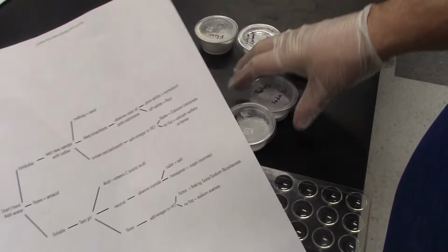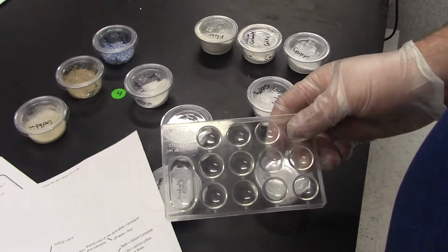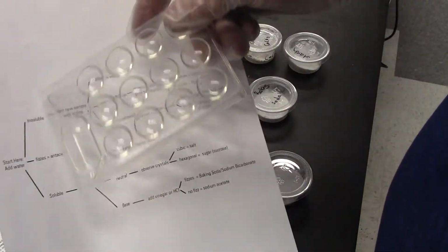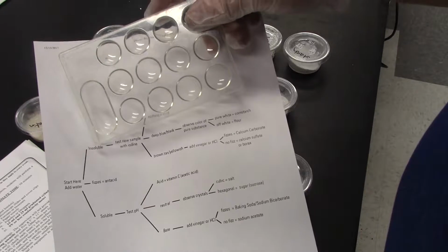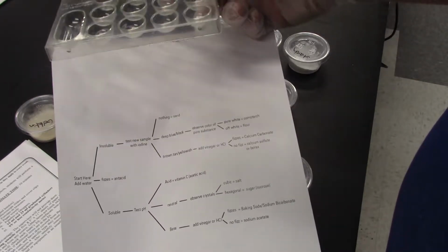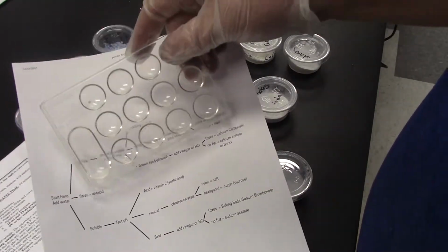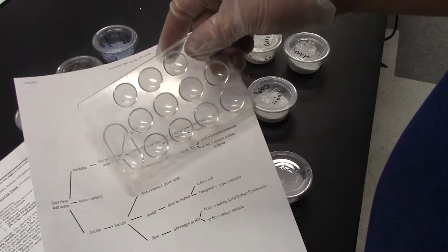What I can do is take a small sample out of here, put it into my spot plate, and then just start working from this set. Insoluble means that it's not going to dissolve in water. Fizzes, we know, is an antacid. Alka-Seltzer is an antacid. That would actually end this particular test. It's done. It doesn't go any further.